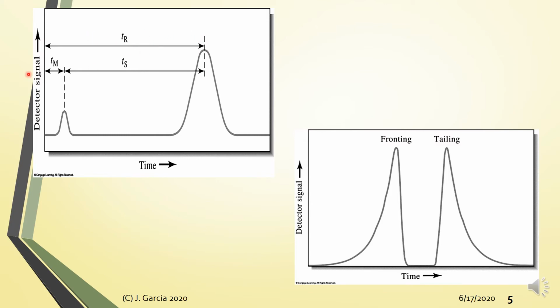Okay. Now t_M is referred to as your dead time, or also called your void time. Alright? So this peak, okay, represents those components of your mixture that you injected that were completely unretained in the stationary phase.